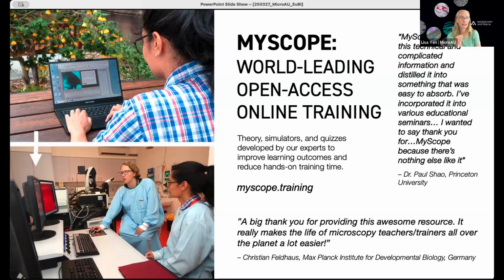But one of the things that it does do is it brings together both a theory, also a virtual instrument or a simulator that gives people the opportunity to play around with some parameters. And then it also does offer a quiz and a certificate, so that it does make that difference in the facility, that can be a requirement before they'll commence that in-person training.